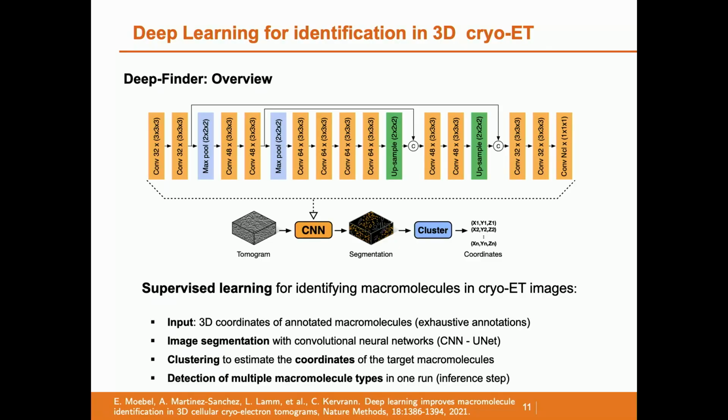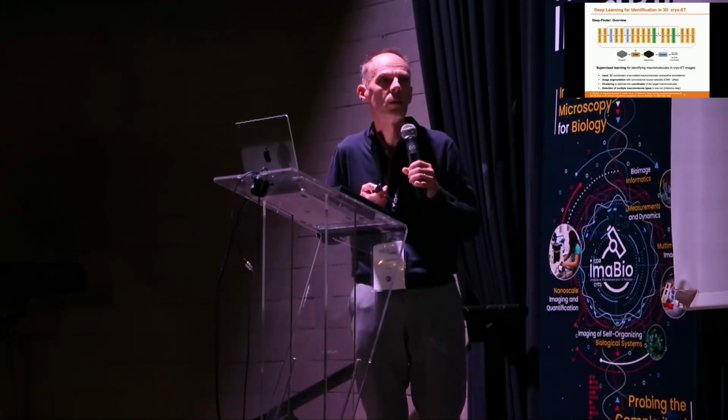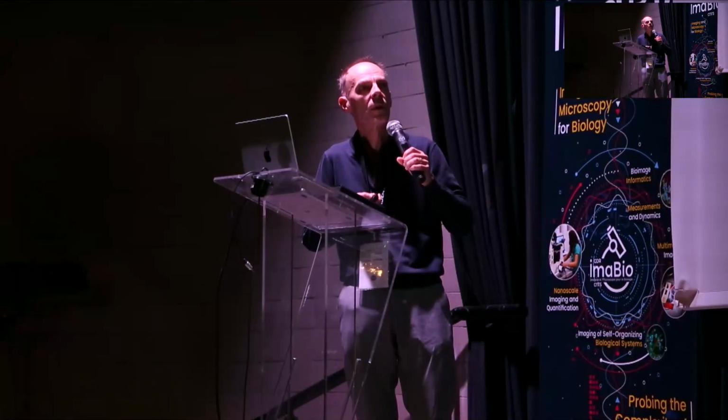Just as information, in general, template matching is used to do this job. It takes maybe several hours to process a 3D tomogram, and each template matching is dedicated to one macromolecule, so you have to run the template matching several times. So it takes a few hours, a few days, to process a tomogram. In that case, our motivation was to detect several macromolecules in one run.